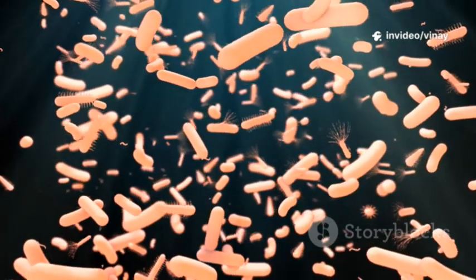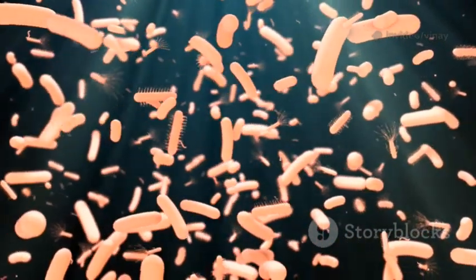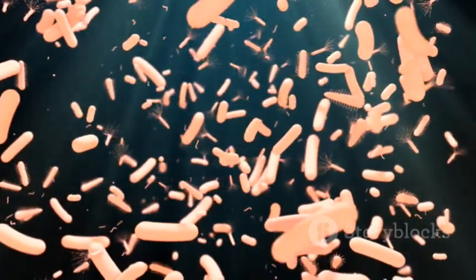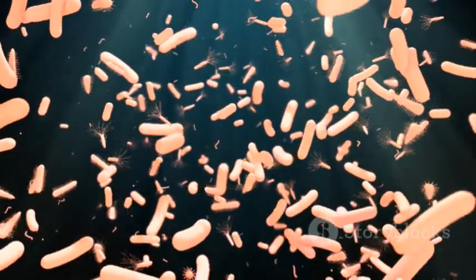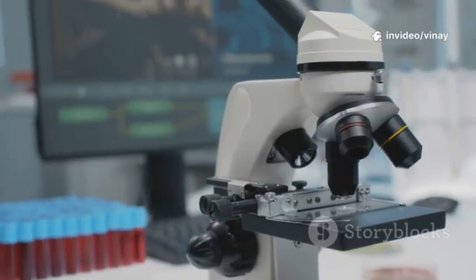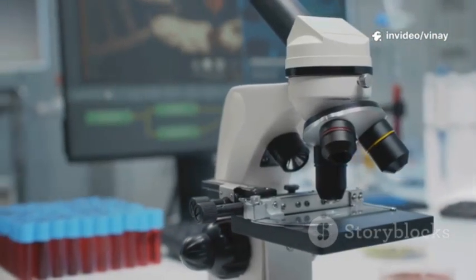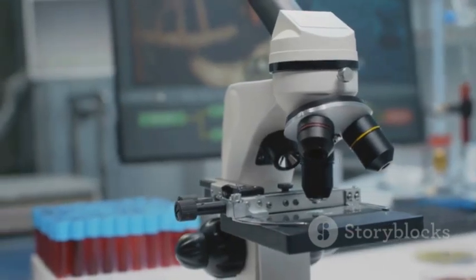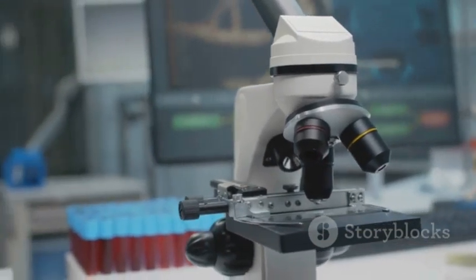But bacteria are much bigger. They are like big, clumsy bears trying to get through that same dense forest. They get stuck. This process is called size exclusion. The filter's pores, or the tiny openings between the fibers, are manufactured to be smaller than the smallest known bacteria, which is typically around 0.22 micrometers.